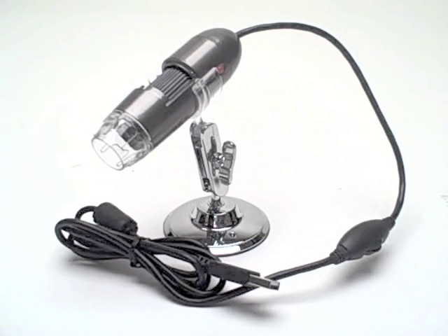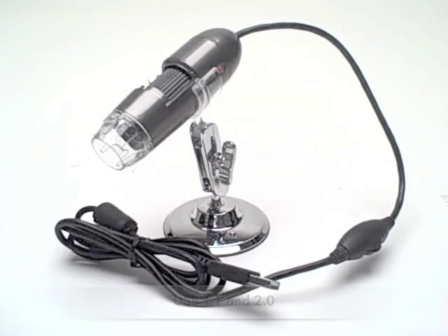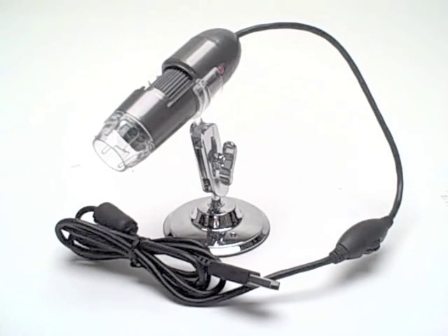The USB microscope is compatible with USB 1.1 and USB 2.0. There's a manual focus on the barrel of the microscope itself which enables you to zoom in on objects as close as 50mm out to infinity.